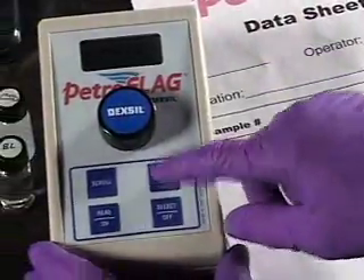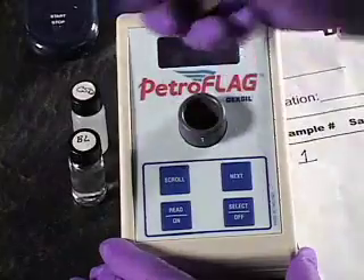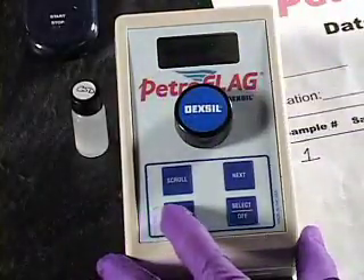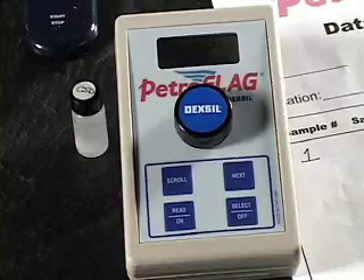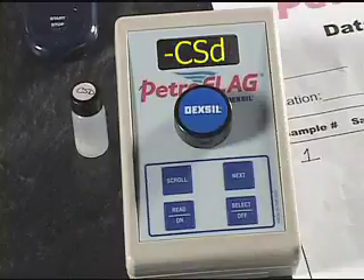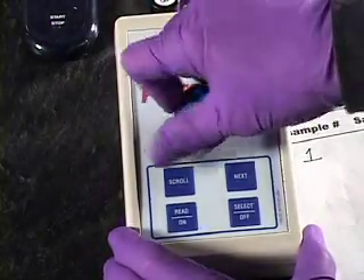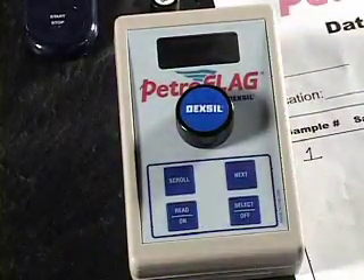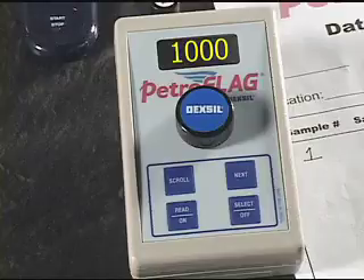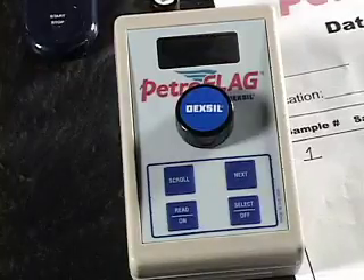At the end of 10 minutes, press the next button on the meter. BL will be displayed — the instrument is ready to read the reagent blank. Remove the cap from the PetroFlag instrument and insert the vial marked BL. Re-secure the cap and press READ. When the instrument has accepted the blank, a zero will appear on the screen. The instrument will then prompt for the calibration standard by displaying the letters CSD. Insert the vial marked CSD. Recap the meter and press READ. When the reading is complete, 1,000 will appear on the screen. The calibration process is now complete and the word DONE will be briefly displayed. The instrument will automatically advance to the read mode. You are now ready to begin processing your samples.